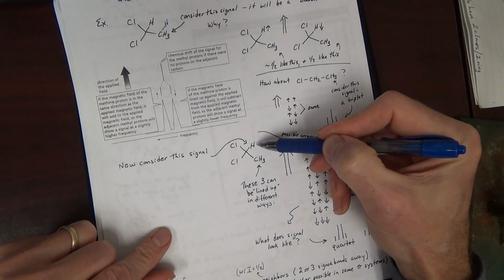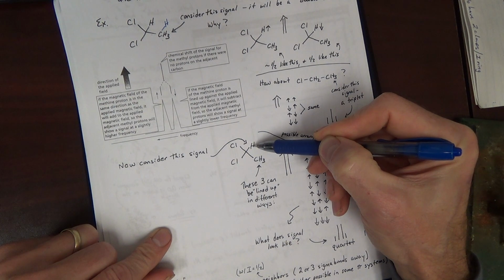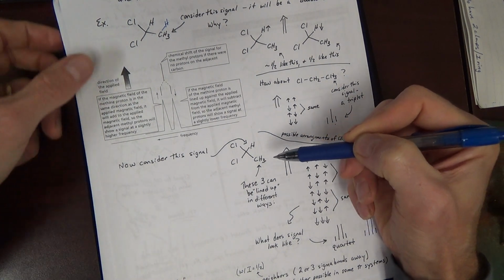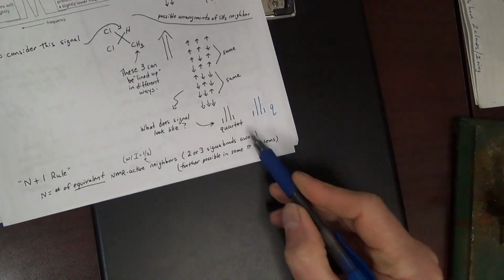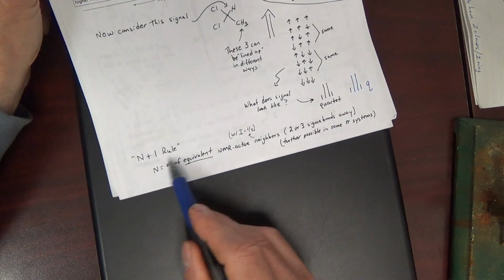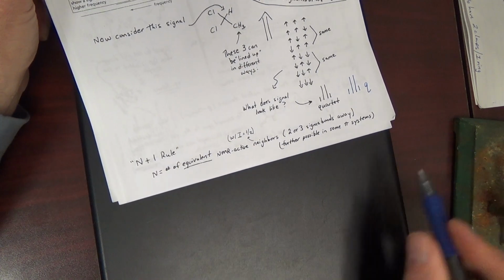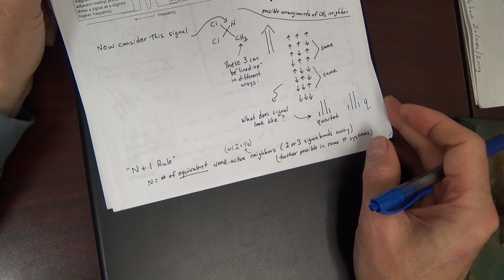Let's look at this H. How many neighbors within 3 sigma bonds? 3. 3 plus 1 is 4. 4 would be 4 lines, and that's a quartet. And indeed, we said it would be a quartet. So the n+1 rule can become a simple rule for predicting your splitting or so-called coupling.